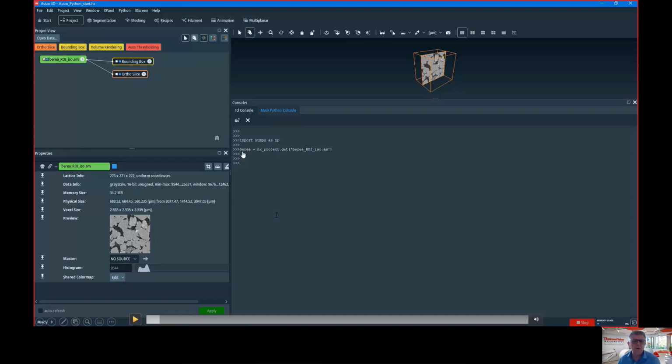Yeah, so this is the code you have to write. You can write it completely by hand or get help by the tab. Anyway, now Berea is a Python object that represents a handle to this data. And now I will ask this Berea object, give me the NumPy array of your matrix.